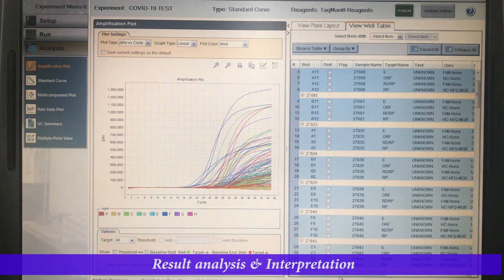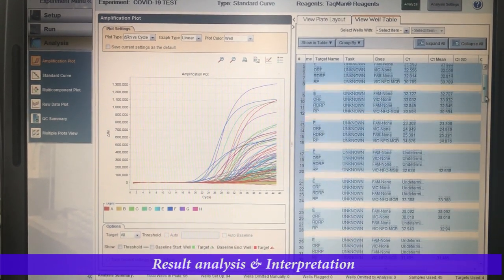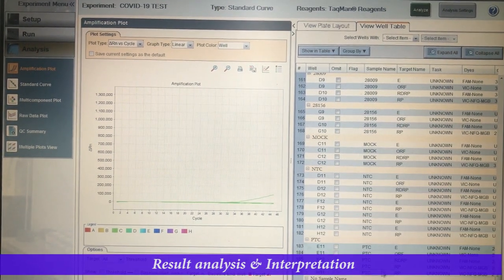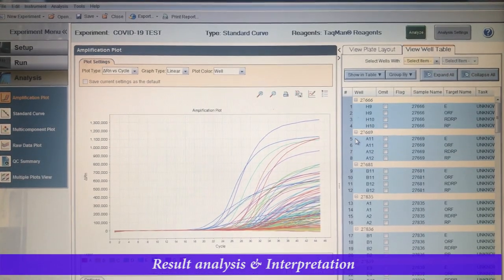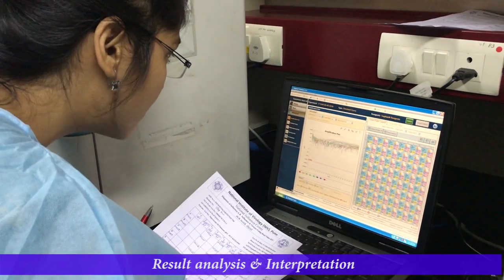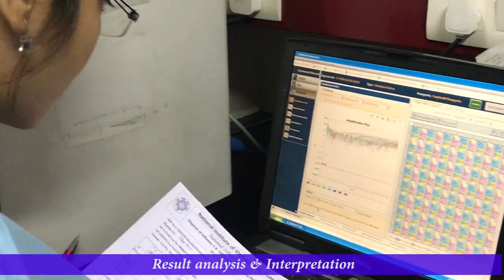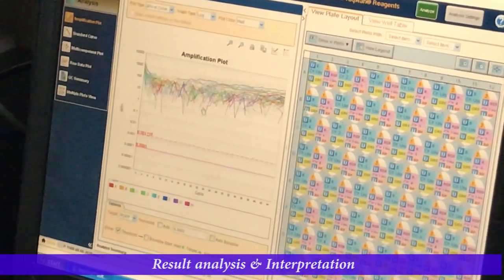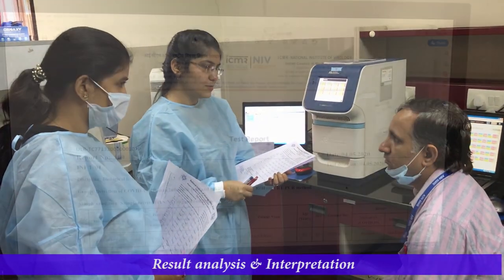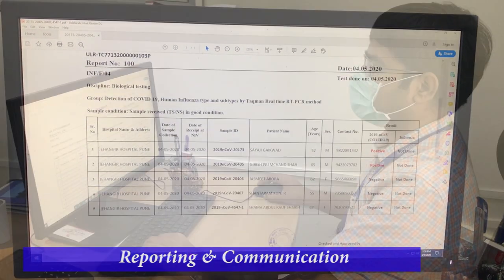After completion of the run, analyze the results by setting the threshold for each target. Note the CT values for each sample and compare with the controls, NTC, PC, and RNase-P. Report the results in the report format and communicate.